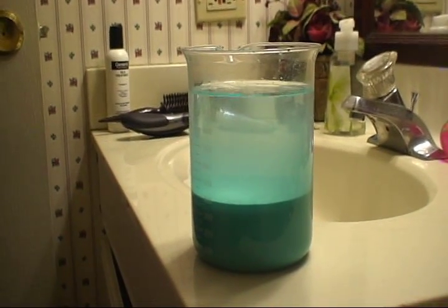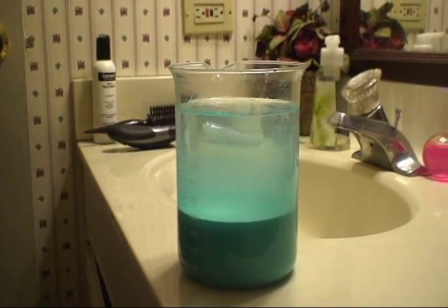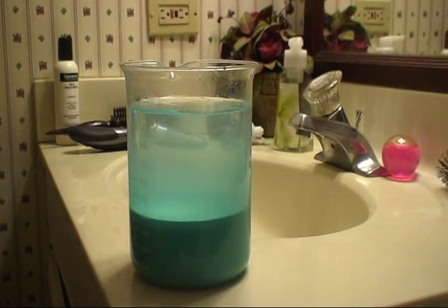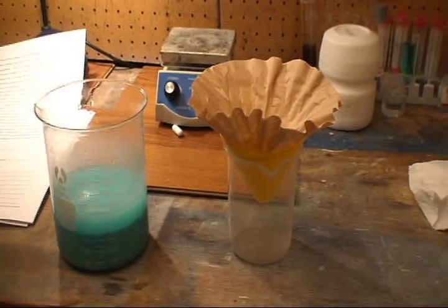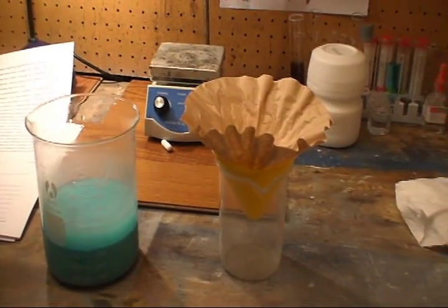Here's the copper carbonate precipitate with some water on top, and now we're going to decant. We have now set up for gravity filtration.